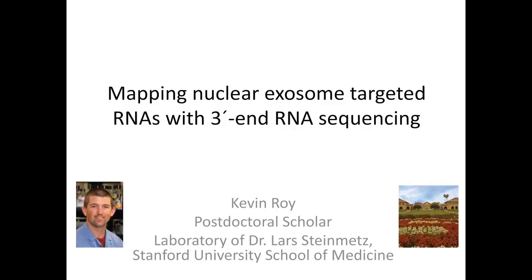Today I'd like to talk first about RNA sequencing in general, and then focus specifically on 3' end RNA sequencing and the benefits that it exhibits for certain studies. And then I'd like to go into some of the biology that we uncovered by looking specifically at the nuclear exosome-targeted RNAs.